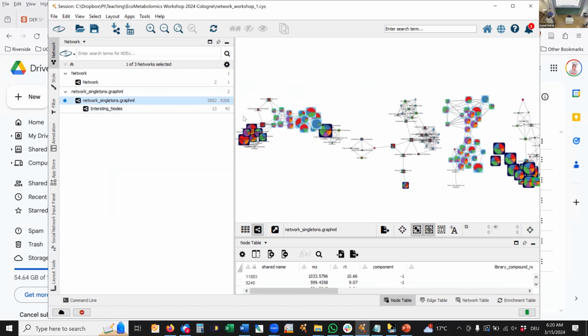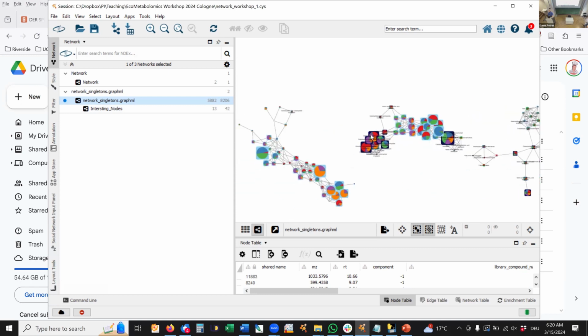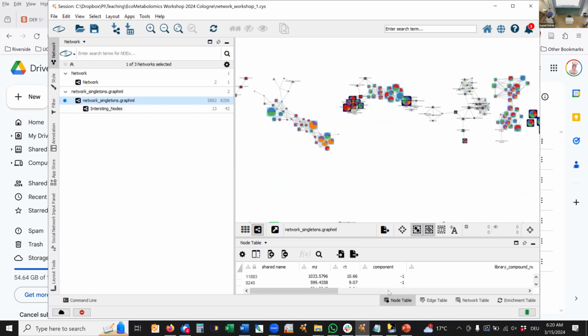And I even have the same styles, with the pie charts, and I have the imported annotations from Sirius and from the networks and so on. And that's also a good point for why I don't think it's important to merge in the annotations at the stats level, because now if I bring those values into my table here in Cytoscape, then obviously I will have the annotations again, and I will even have more because I have the Sirius molecular formulas, class levels, and so on.